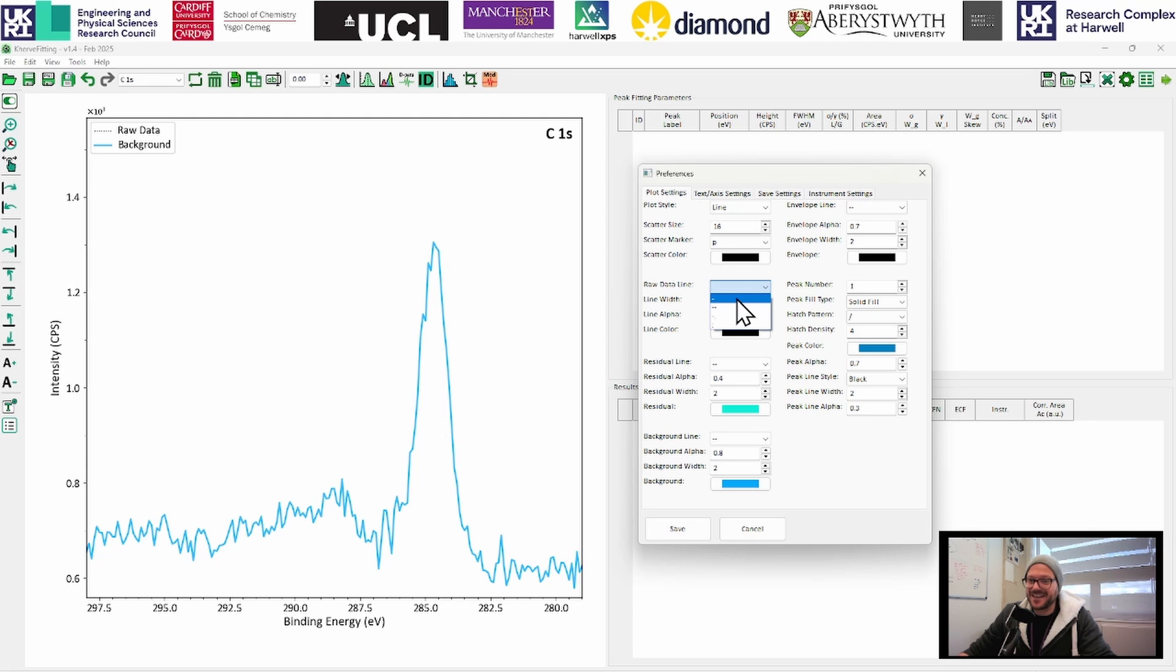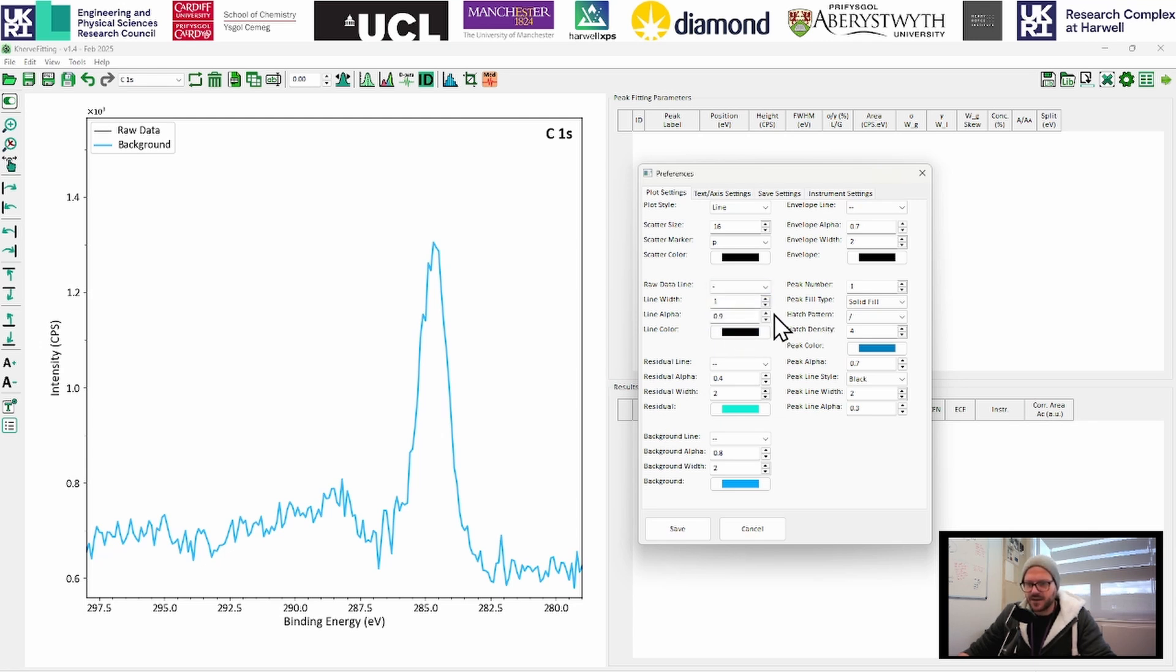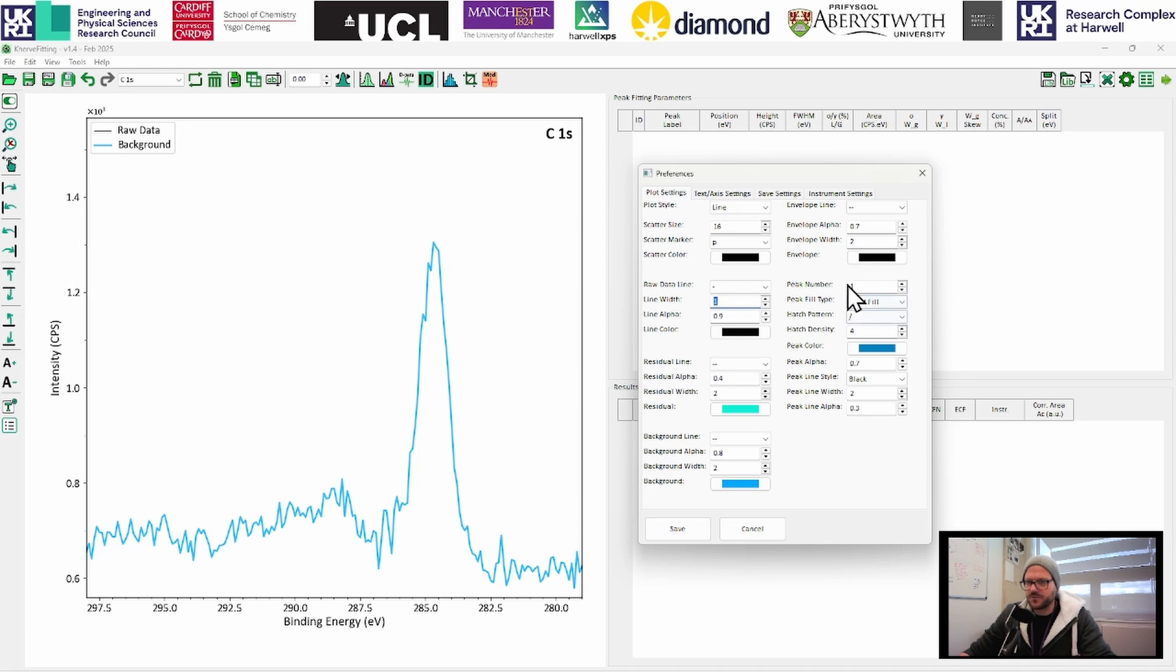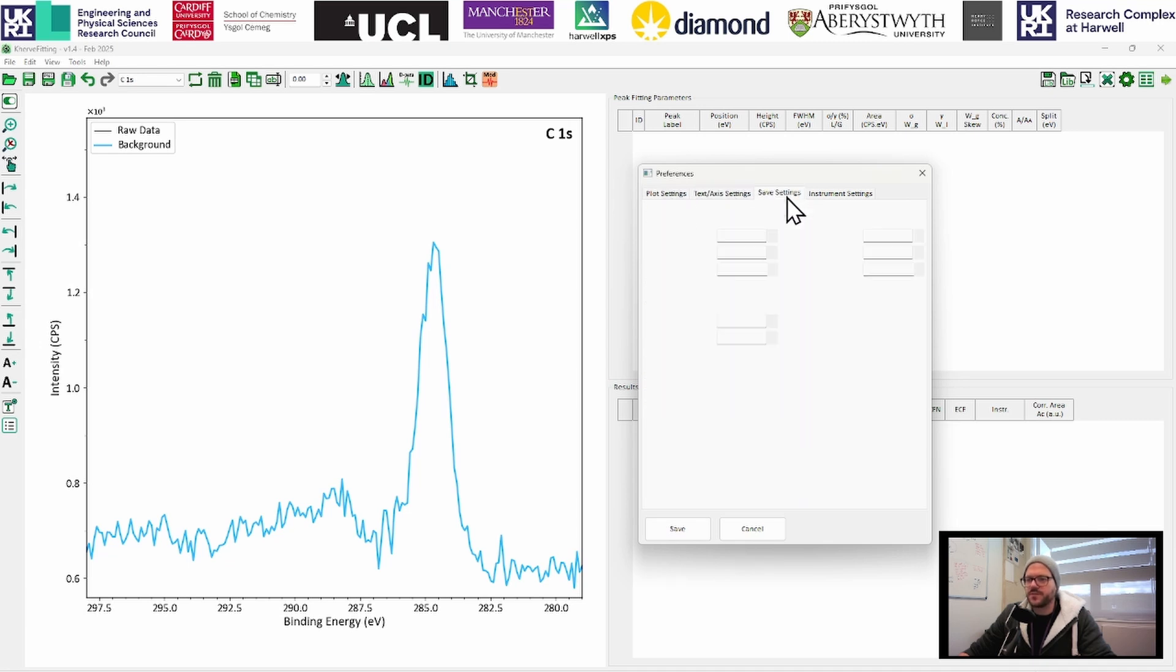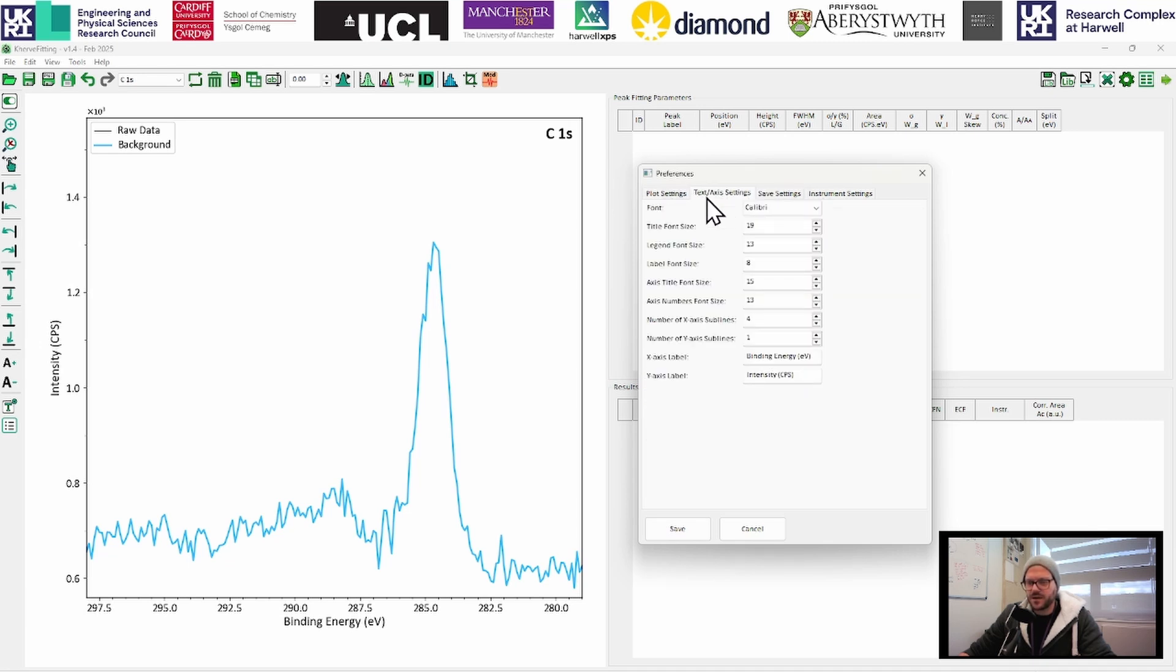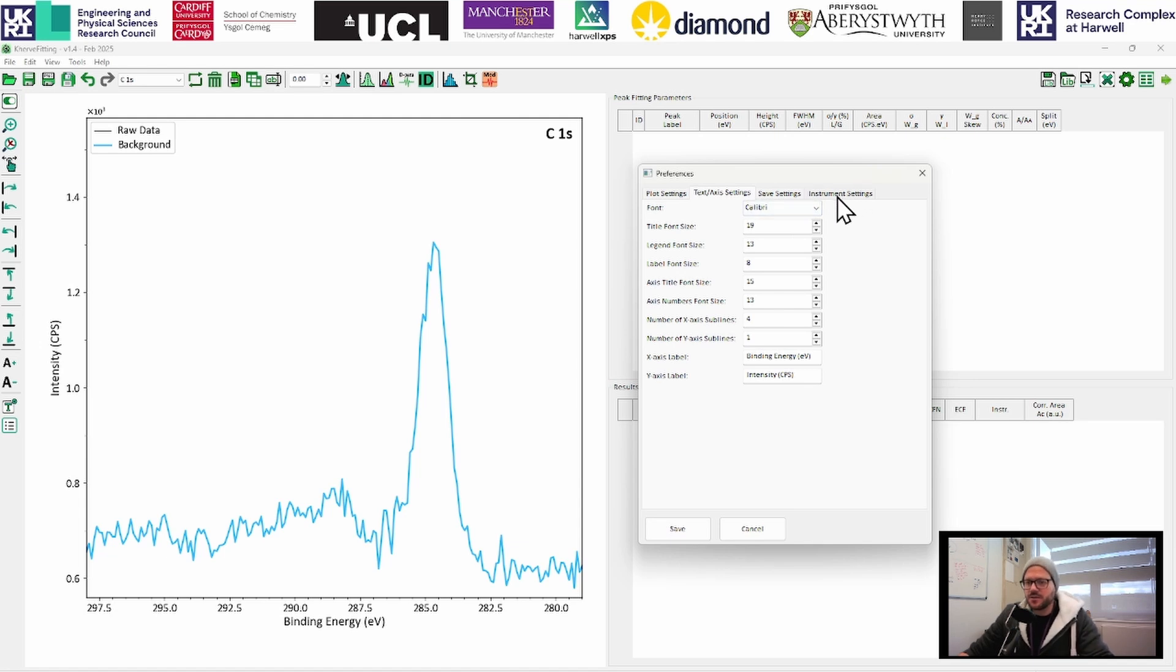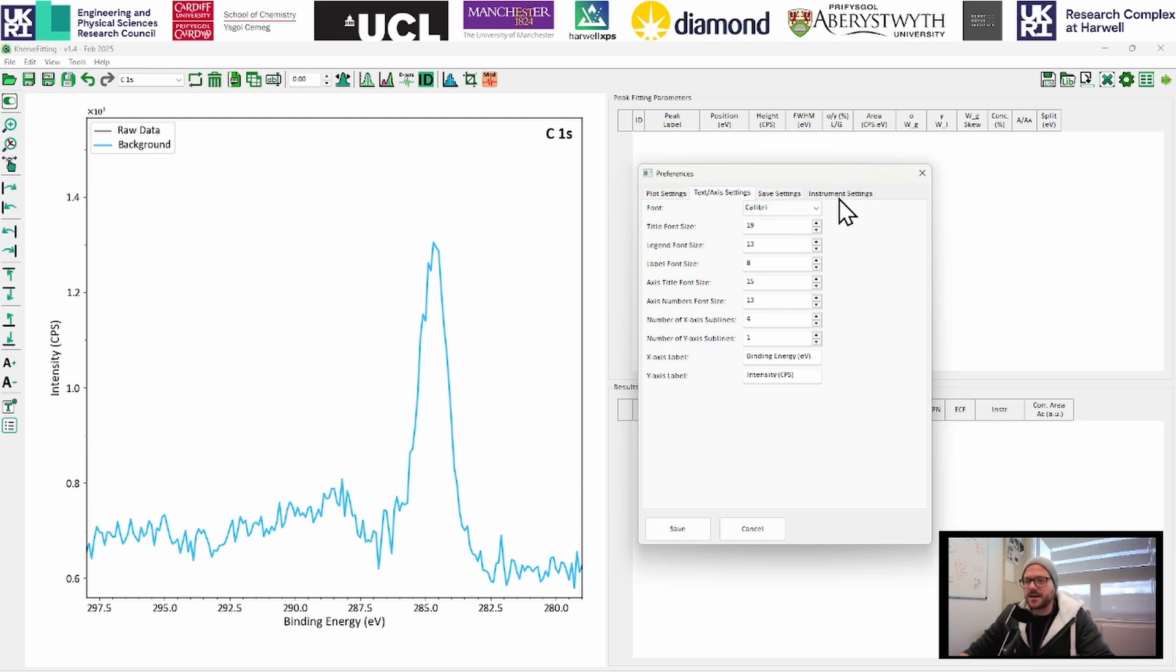So you can set your settings here. The raw data line, you can change the line type, whether you want it dashed dots. Solid line, we're going to stick with a solid line here. And just go for a line width of one. Same for our background, you can change all of those here. All of the different settings that are available to you, you can find in these tabs.